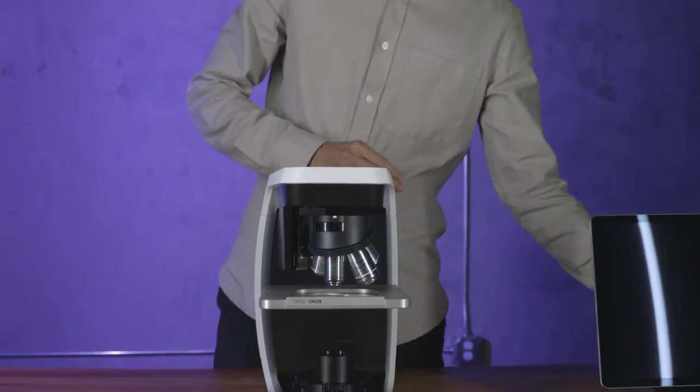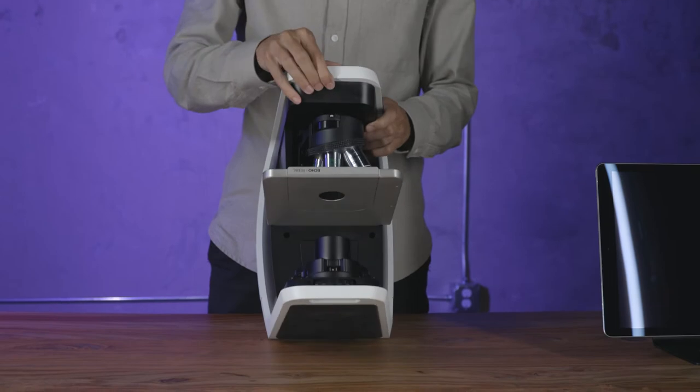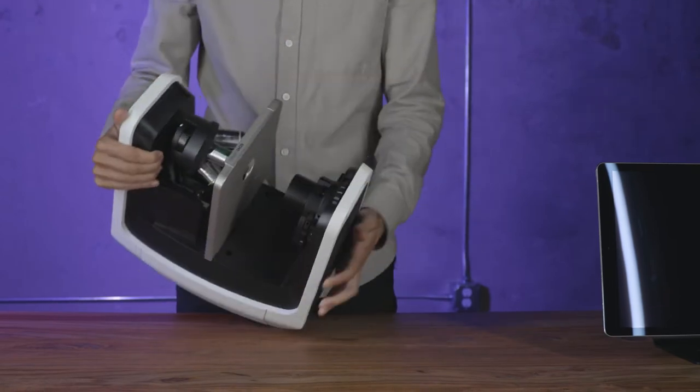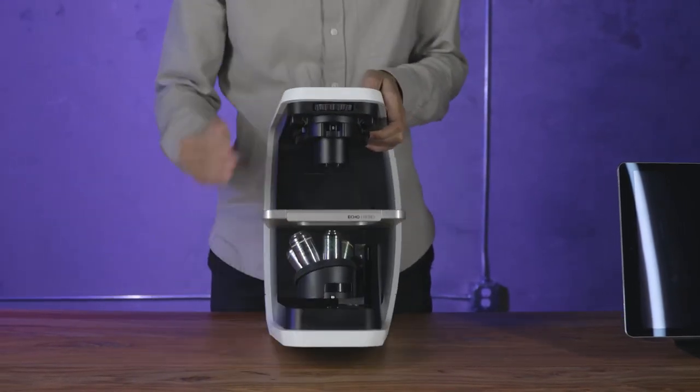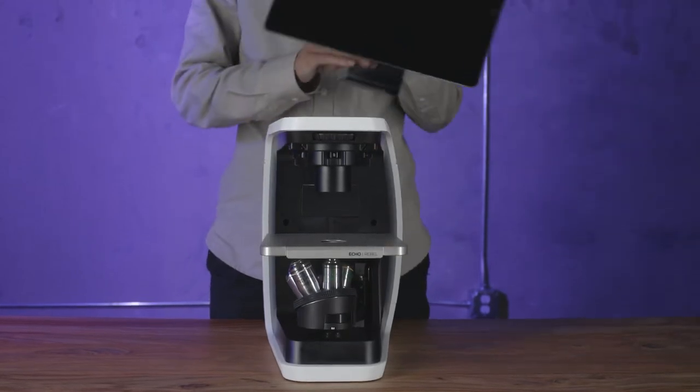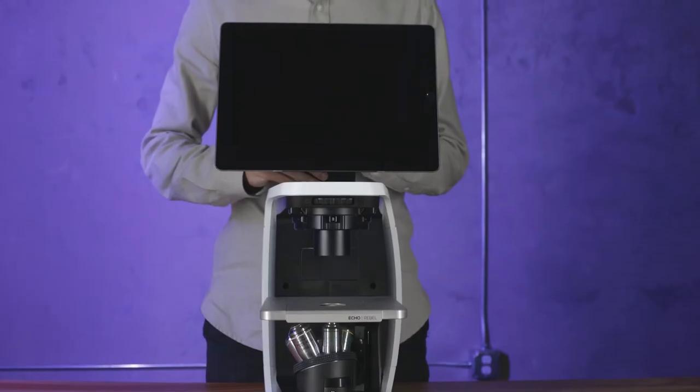To switch modes, simply remove the display, rotate the microscope, place the display back in, and you're ready to go.